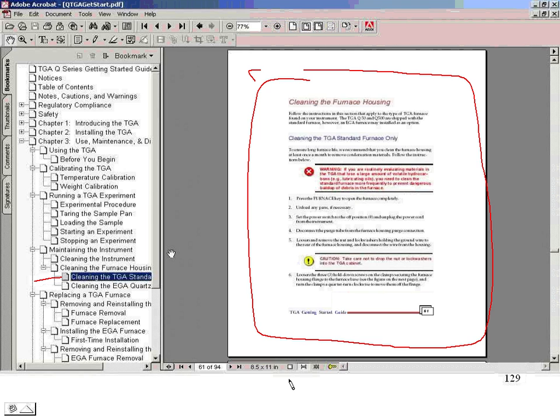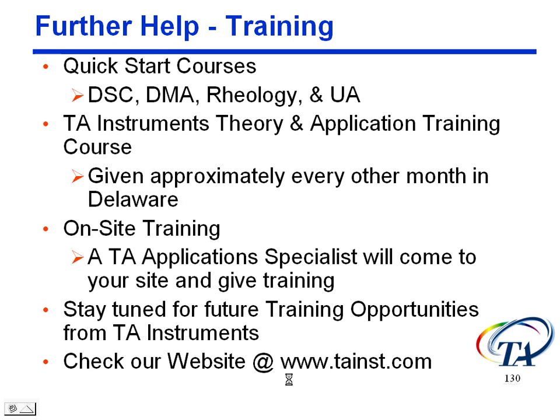Further help. Like I said, there are quick start courses for different techniques. We have quick start courses for all the different instruments. We also have them for the data analysis, universal analysis, and the rheology data analysis. We're also starting some advanced courses, so be sure to check out our website. It's listed down here to give you an idea of what some of those courses are.